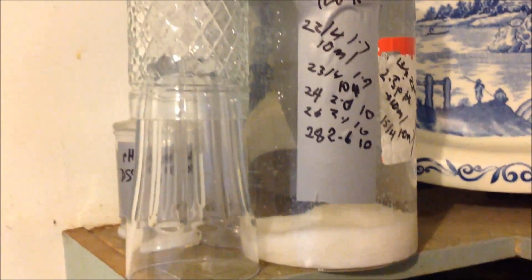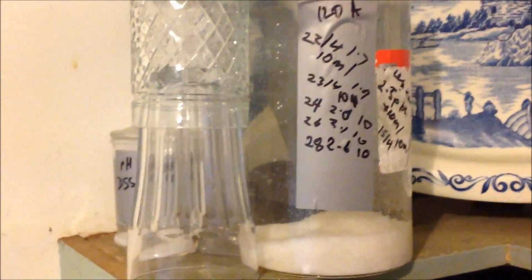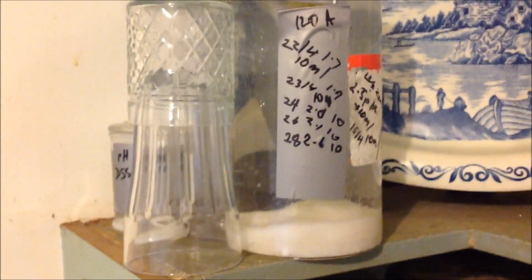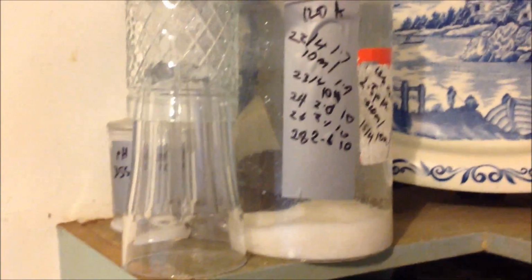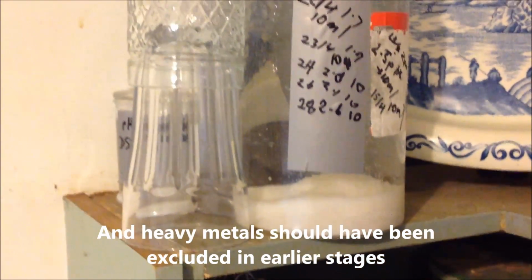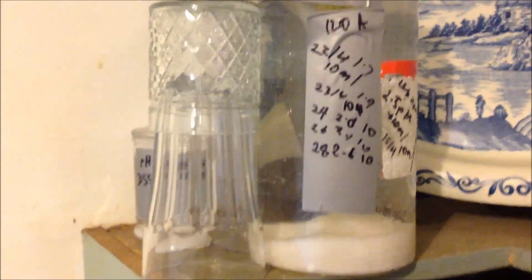So I think I'm going to have to take it all the way back to pH 1 and then on up again. If it wasn't above pH 12, I could possibly have racked some of that solution off, because everything I wanted would have been precipitated, but it said that M-state material will dissolve above pH 12, and that's what this is, so very annoying.